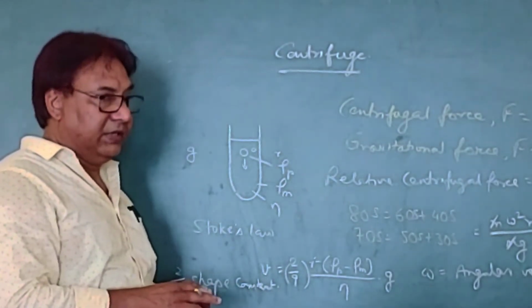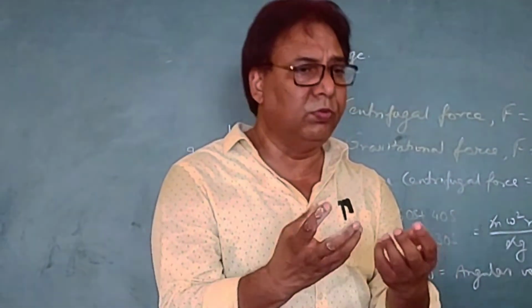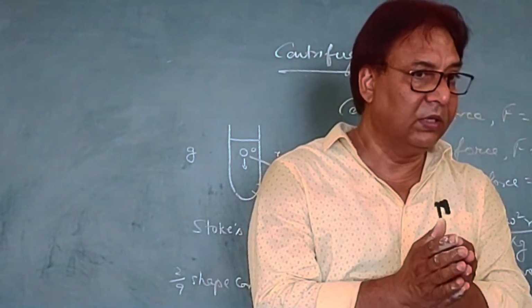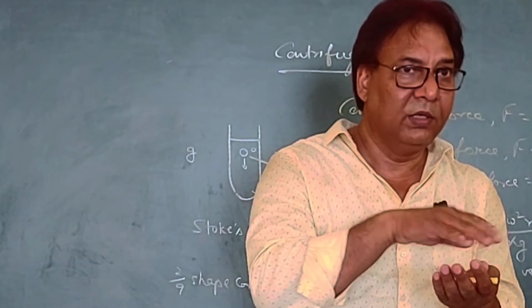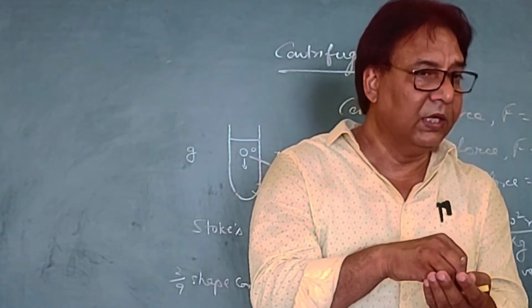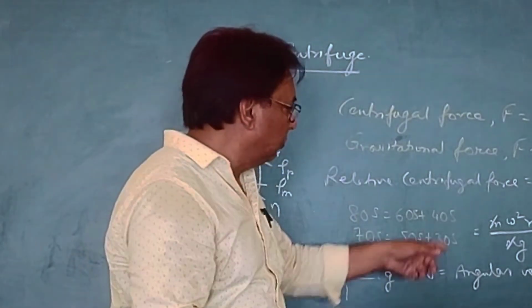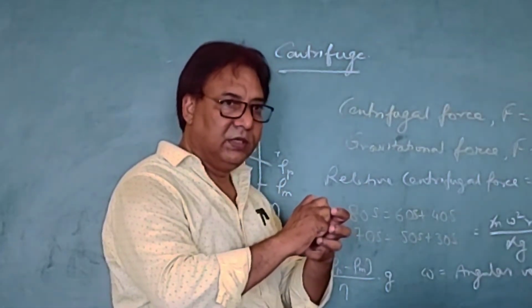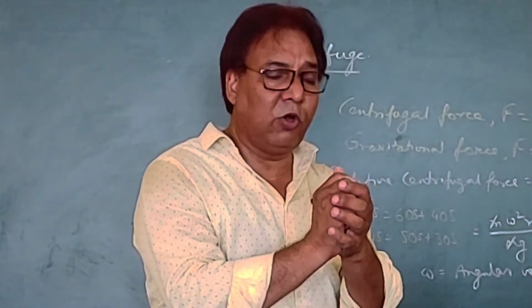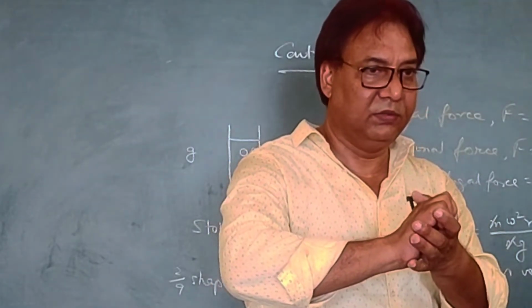Okay, sedimentation rate. Take two bodies having equal masses but different shape. Archimedes principle you must be knowing. If you change the shape of a nail, if you make it flat like a boat, it will not sink, isn't it? So shape is also important, not only mass. When these two bodies fit together, they become compact. The shape that they attain cannot have the additive value of those. It depends how they fit together.